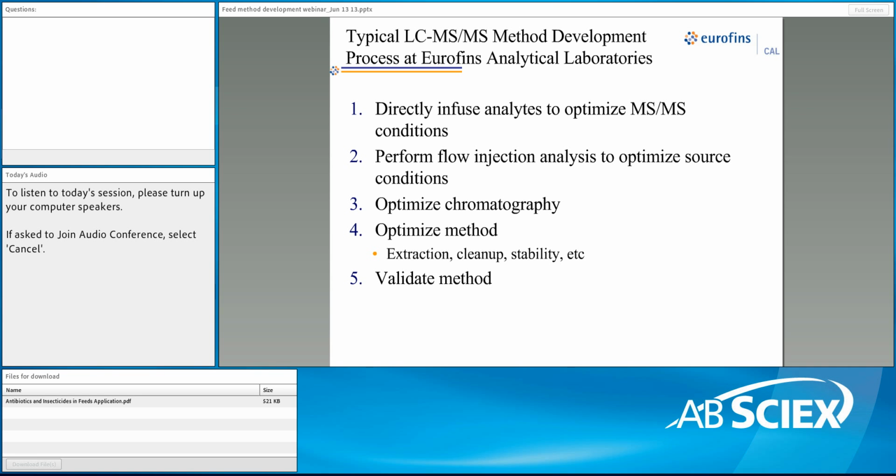Our next step then is to go ahead and develop and optimize the chromatography, and that's pretty self-explanatory. We try to get these first 3 steps in place first before we do a preparative method, so that we know that we have a good analysis technique on hand.